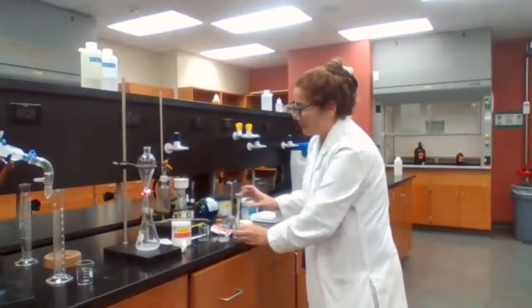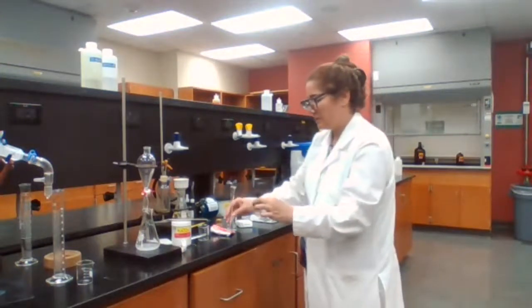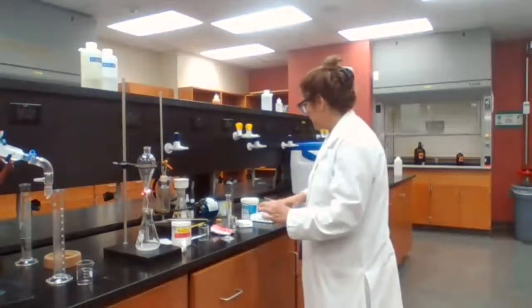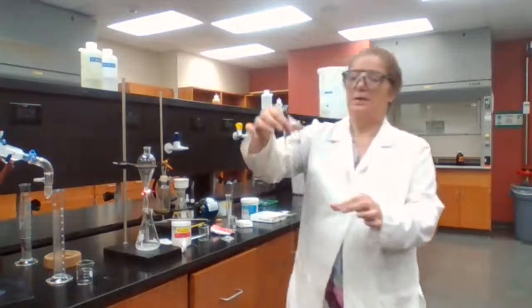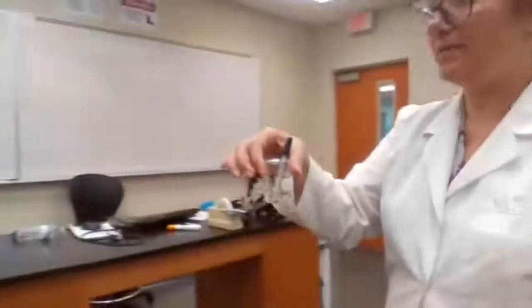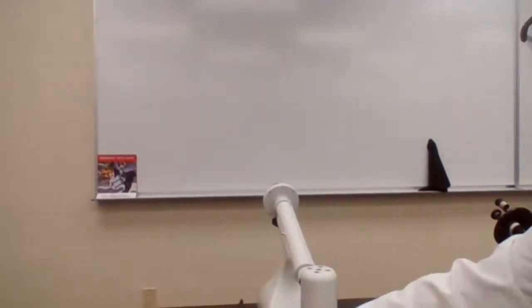Okay. Going to add 7.4 milliliters of methanol, because that's based on the procedure. And now I have my solution to test with the polarimeter. I hope my polarimeter is going to work, because we are using new cells, hopefully it's going to be enough. If not, I have to add more methanol, and I will let you know if I add more methanol.